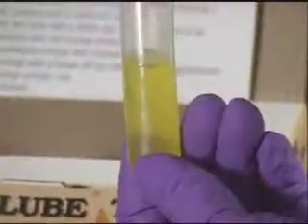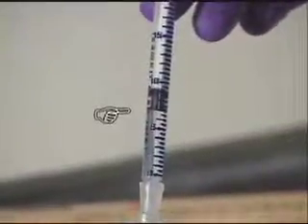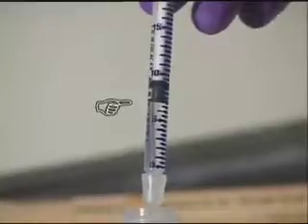Remove the titration syringe and read the TBN value where the bottom of the black plunger aligns with the TBN increments printed on the side of the syringe.